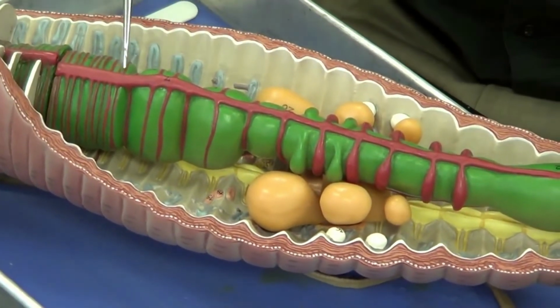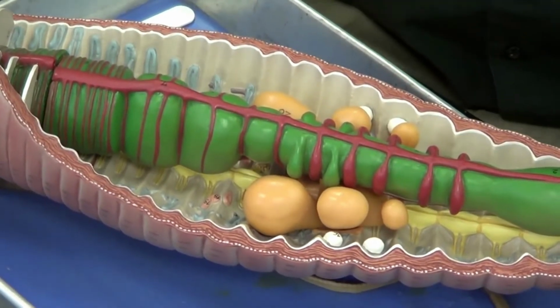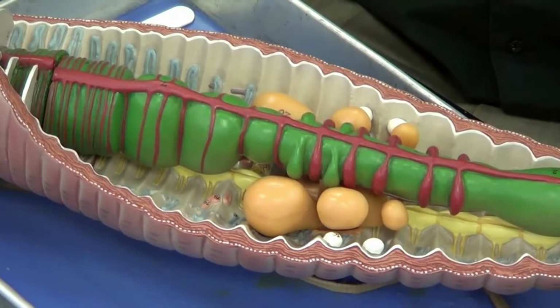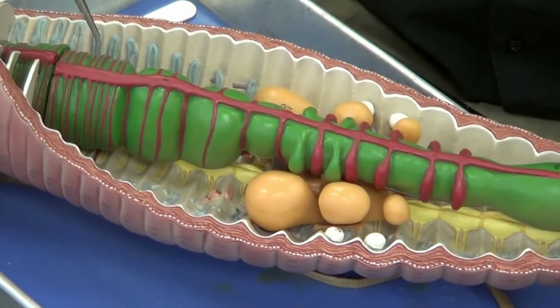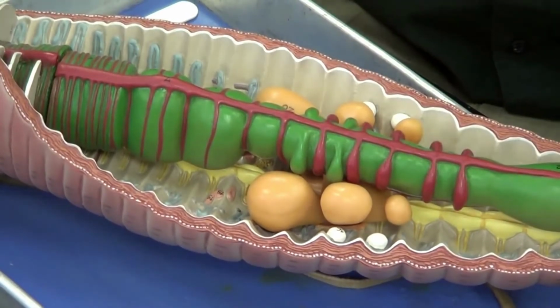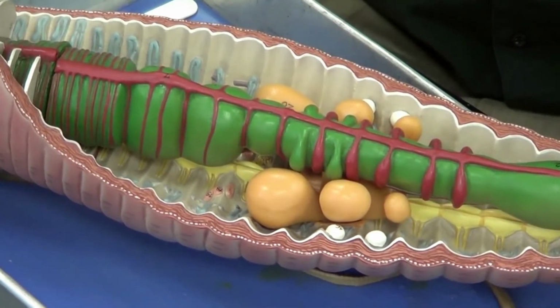From there, we're going to go into the last part of the digestive tract, referred to as the intestine. Now, the intestine is probably going to make up 70 to 80% of the earthworm. And it's going to be that way for a reason, because we're trying to digest and absorb small bits of organic material mixed in with lots and lots of topsoil. So in order to do that, we have to create lots of surface area.